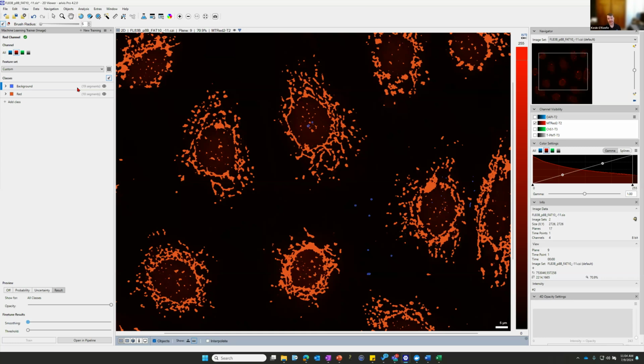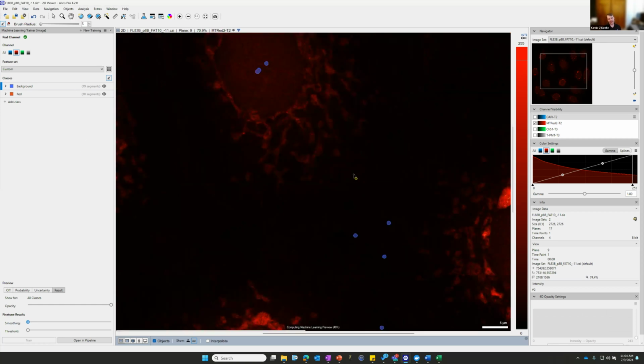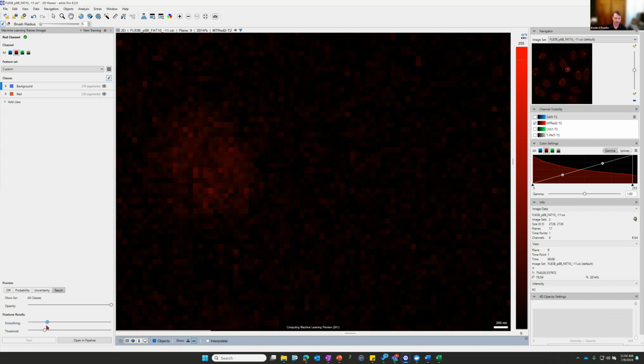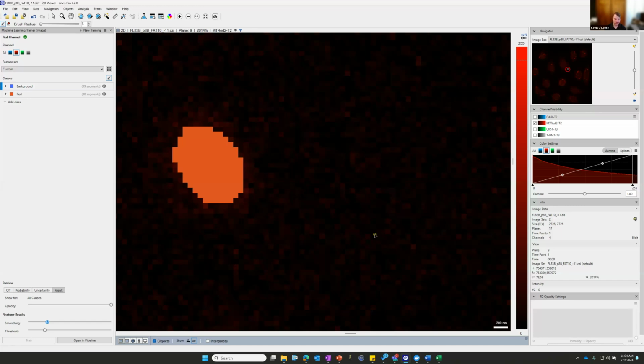And the way that you'll test it is, let's say you have like 100 annotations in background, 100 annotations for your class. And let's say I really want to include this as background, but if I draw this all as background and it's still not changing the result, that gives you an idea that your model's kind of maxed out on the learning potential that it has. Then at that point, you can go and see if adjusting these values or doing some pre-processing beforehand can kind of help it. Okay.